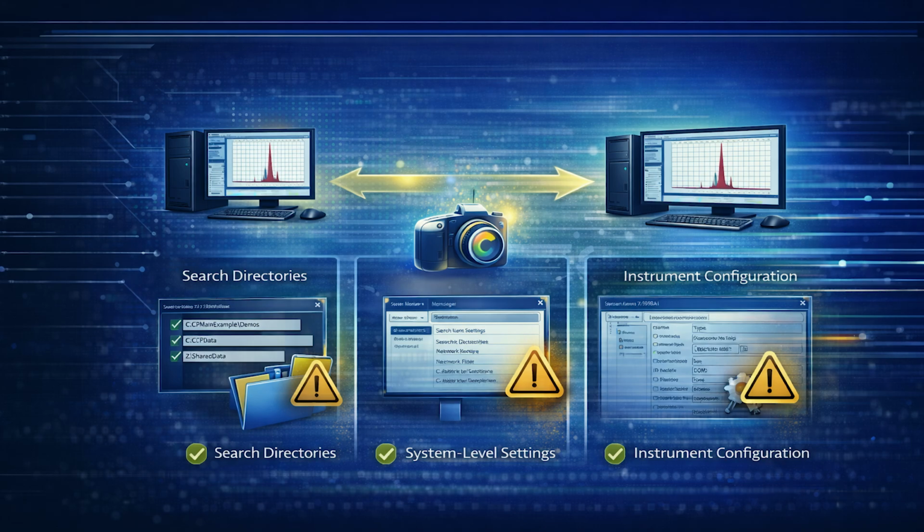First, the search directory configuration, so that the same paths can be recreated accurately. Second, system-level settings, particularly if user logons, security options, or user restrictions are enabled. Finally, and most importantly, each configured instrument.